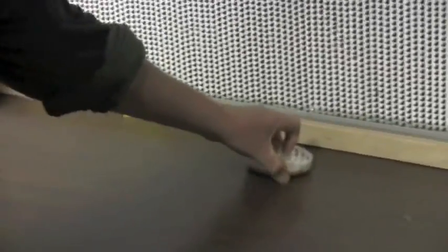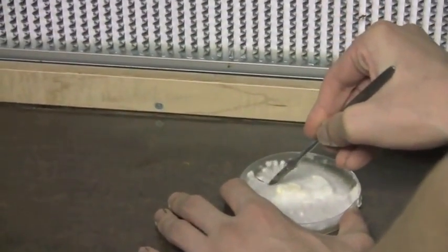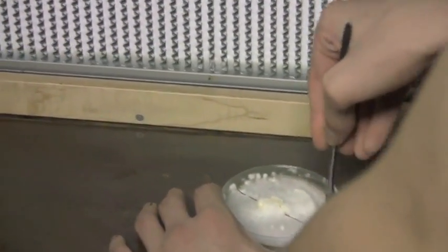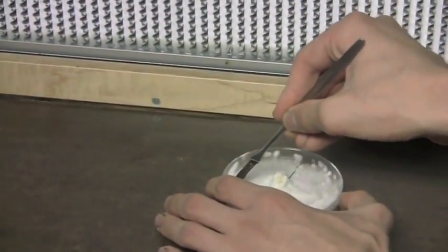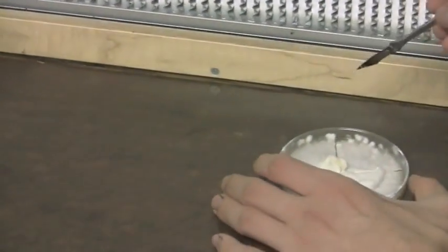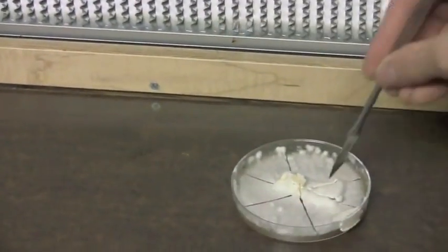And we're unwrapping our petri dishes, setting them in front of the flow hood. Next, we're going to slice the petri dishes into wedges. This particular dish has got yellow oyster spawn that's grown out quite well. We're going to make 6 slices, and we're using a sterilized scalpel that's been left in the flame of an alcohol lamp.